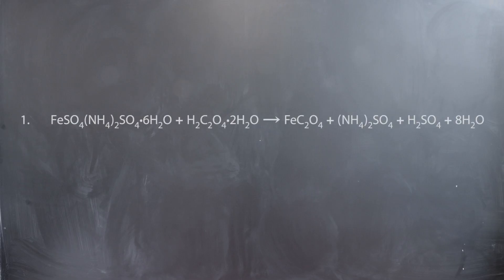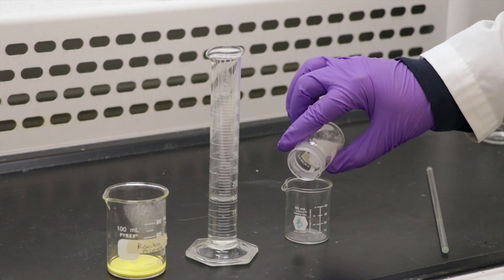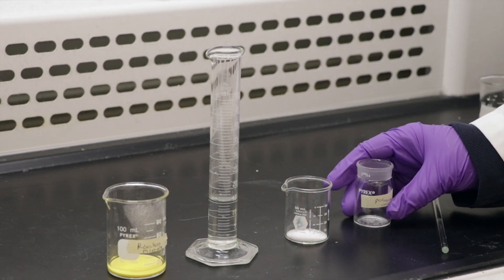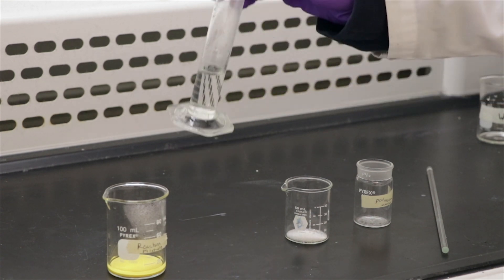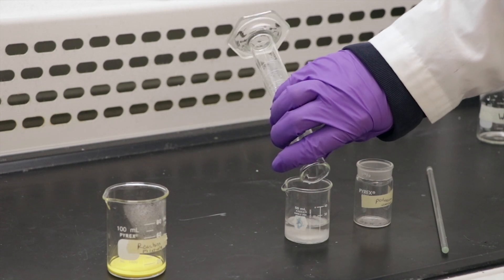Congratulations! You have now completed the first step of the synthesis and have successfully created ferrous oxalate, the yellow solid forming in your reaction vessel. While the solution is settling, prepare your potassium oxalate solution. Measure out approximately 3 grams of potassium oxalate on the top loading balance and dissolve it in 15 ml of hot water.